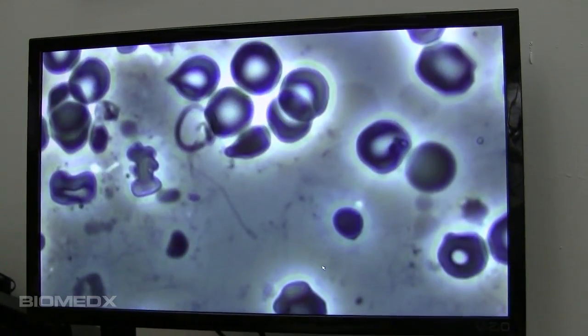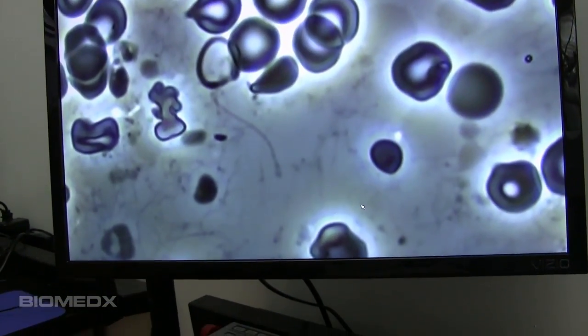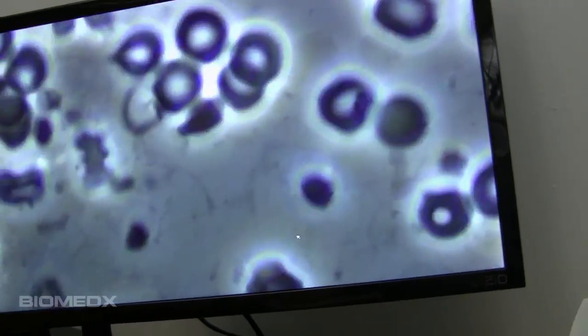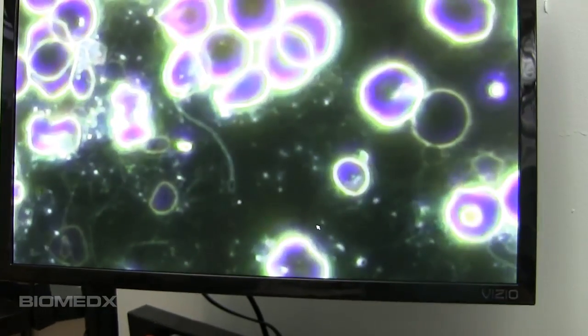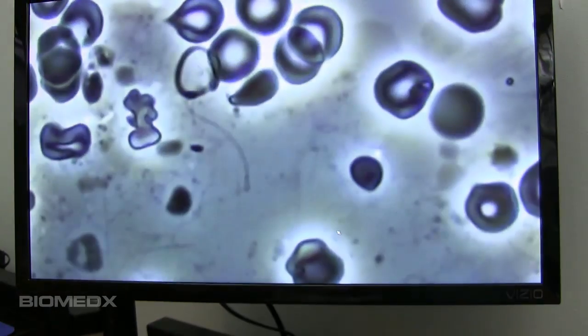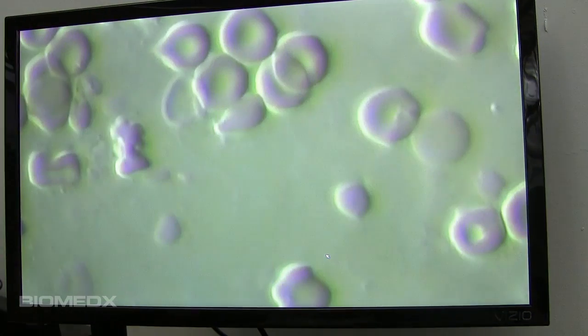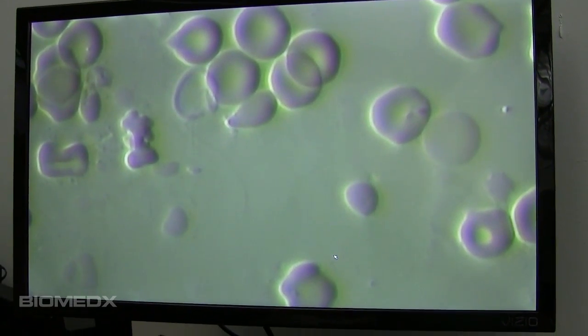So you can easily just move back and forth and go from one view to another — this is what it looks like in dark field, then flip it to phase contrast, and that's what it looks like in phase contrast. And we do have, slightly off of dark field mode, our 3D view, so you can see the dimensionality on cells.